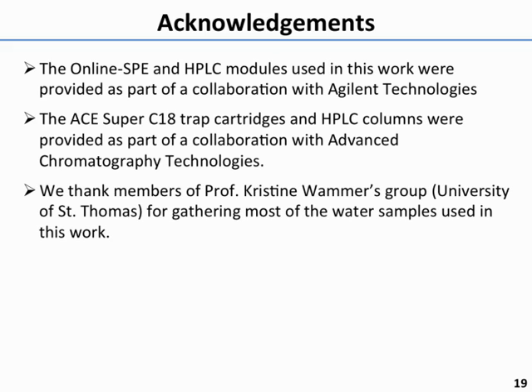But especially in the online approach, I don't know that we've necessarily evaluated the importance of EDTA from a recovery perspective. What we definitely know is that it helps us maintain the performance of the analytical column. If we don't have it there, peak shapes run downhill in a pretty big hurry. In this case, the analytical column only sees the EDTA in terms of whatever comes out of the cartridge. So it's not a very big amount, but it seems to be important. Otherwise, we run 20 samples, and then we have to take the column offline, run some EDTA through, and then reinstall it.